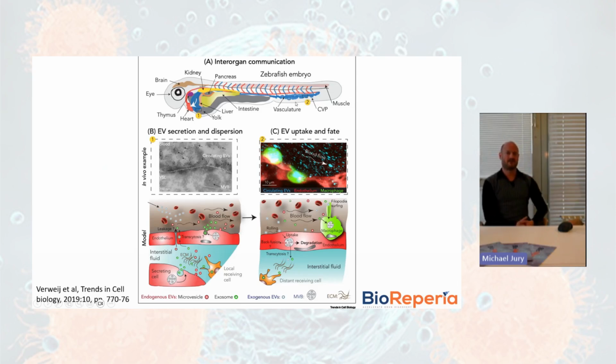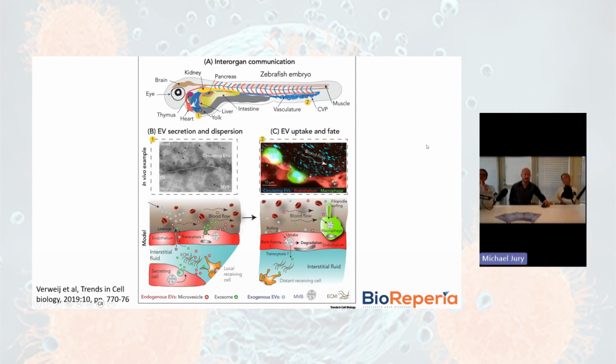So a lot of these specifics related to the vasculature in adult animals are actually already laid down at 5 days and can be studied in these early larvae. Also, other organs such as the liver, the pancreas, the kidney, intestine. I will show what they look like for real soon, not just in an image like this, but they can be identified and followed during these stages of development.